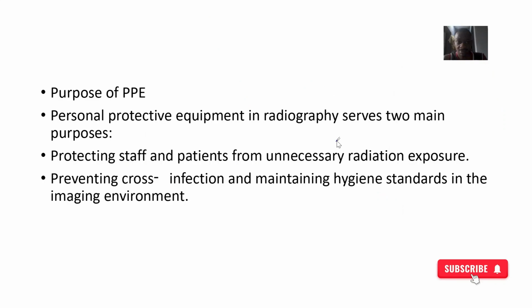So what we got is this. Purpose of PPE in the first place. Why should I wear the PPE? It serves two main purposes. It protects the staff, and you can also give a PPE to a patient, to protect the patient from unnecessary radiation exposure.